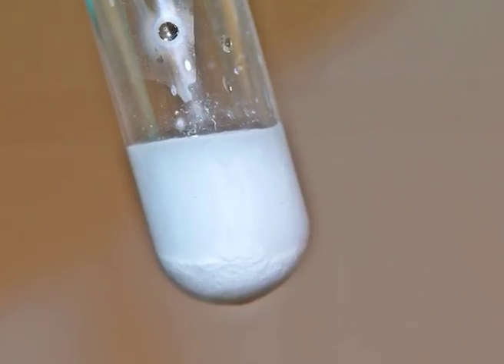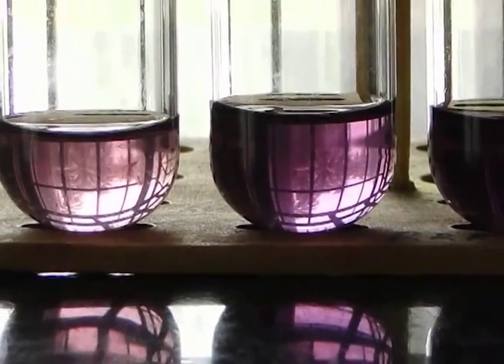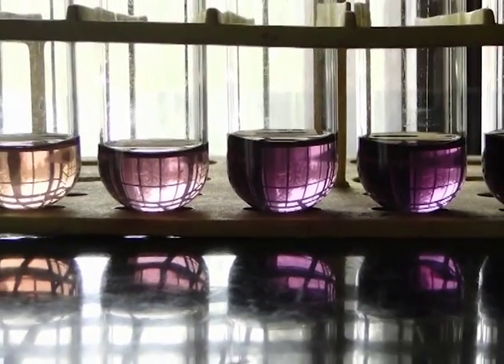The reaction product, that is silver chloride, is relatively unstable and when exposed to ultraviolet radiation or sunlight decomposes to finely divided silver, visualizing the ridges as dark hue, usually black or brown in color. It is a destructive technique. The ninhydrin method of developing fingerprints on porous articles was standardized later. However, this method proved more advantageous and subsequently replaced the silver nitrate procedure. A sample fingerprint developed by silver nitrate technique has been shown on your screen.